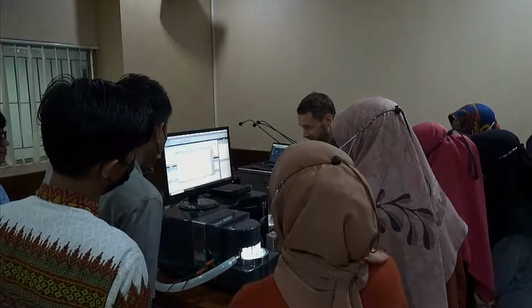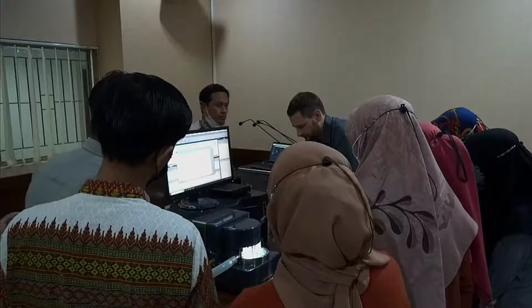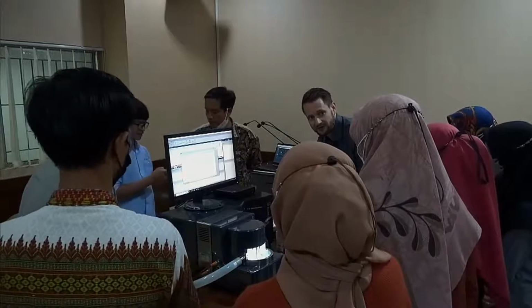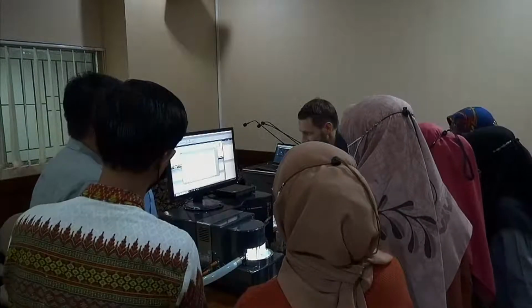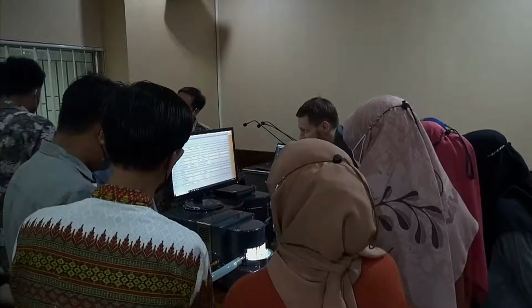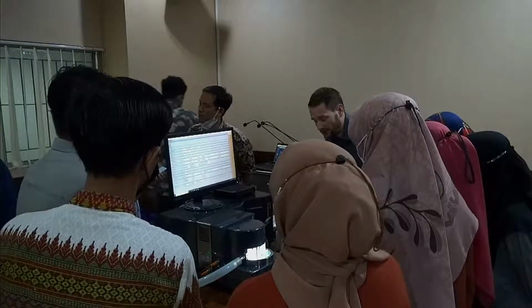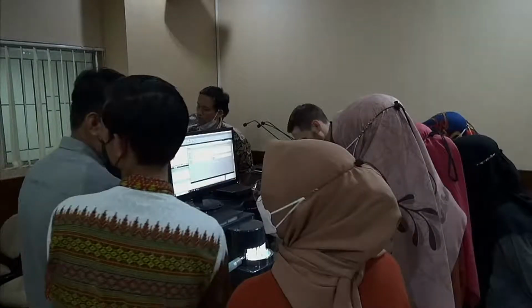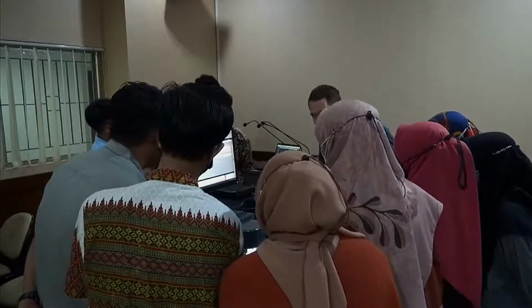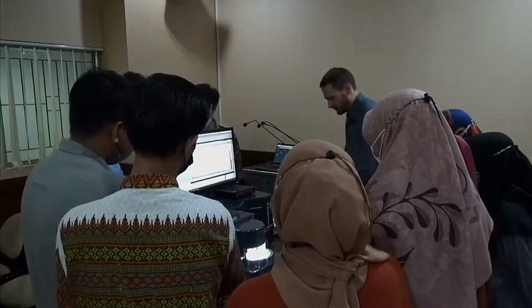So we do the coconut milk, because this is basically a mix of an emulsion and a dispersion, because in coconut milk you'll have fat, but you'll also have particles. It's actually a very special biological sample. So let's see how that goes. Ultrasonic, I think on that one we can leave it switched off. I will also measure now with Fraunhofer, as I have no idea for the particles. By the way, if you measure an emulsion, you can make a simplification. An emulsion, no matter what it is, you always use the same parameters, 1.475 and 1. That's pretty nice, because you can always use the same parameters no matter what.